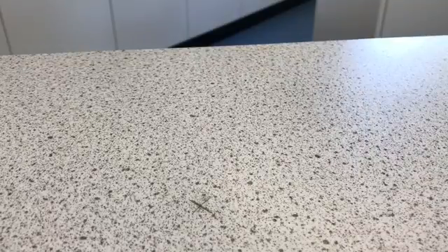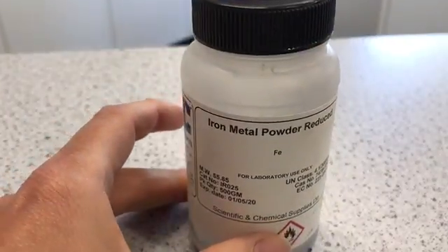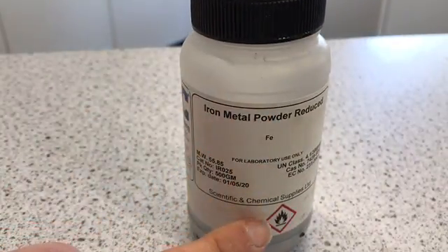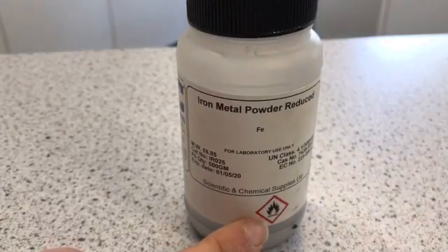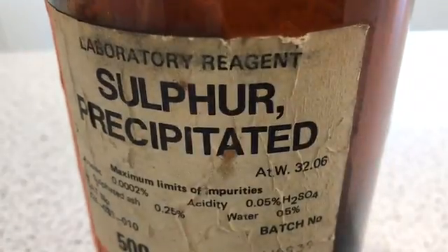Today we're going to be making a compound out of two elements. The first element is the metal iron and we are going to be using the powdered form, and we can see that it is flammable. The second one we're going to be using is sulphur, which is a non-metal, and again we're going to use a powdered form and again it's flammable.